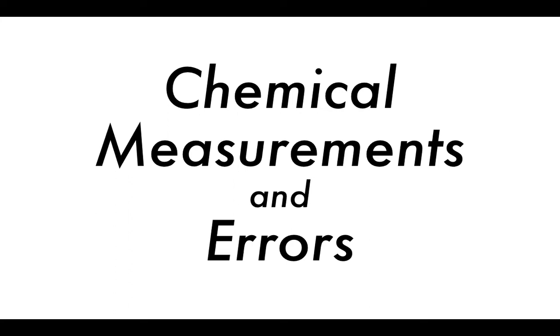So we're going to be talking through some of the relatively common equipment that you might see in a chemistry laboratory, some things that you might be utilizing, some equipment which is useful in terms of measuring or dispensing quantities of especially liquids and solutions. We'll be talking about errors that exist within these measurements, such as random errors and systematic errors, and also some ways that we can mitigate these errors or overcome them and ensure that our calculations are accurate.